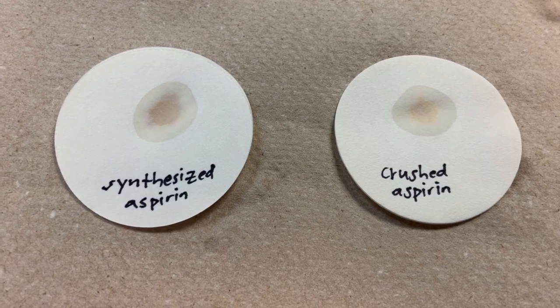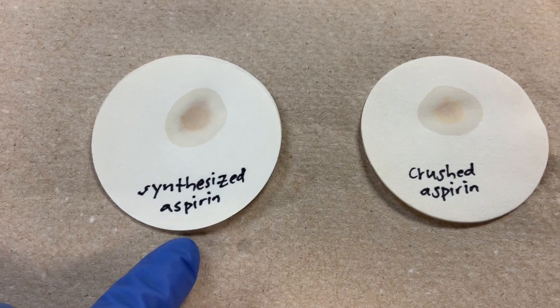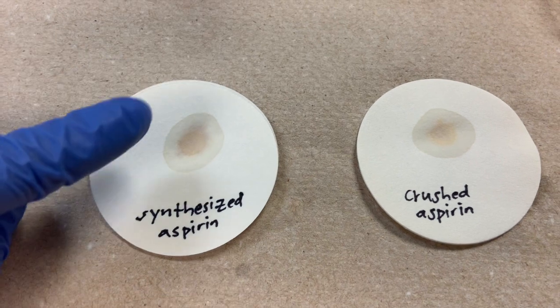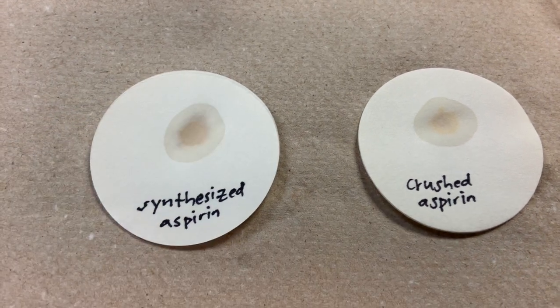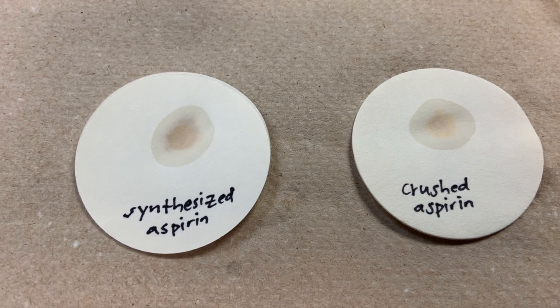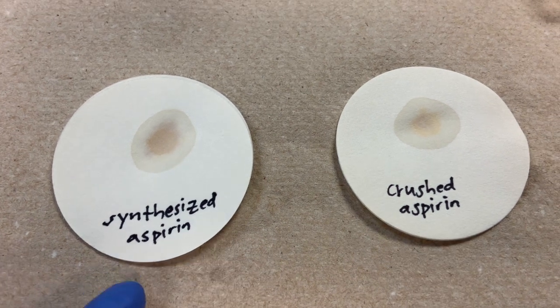So I just added a drop of my synthesized aspirin solution. So it's the synthesized aspirin mixed with acetone. And I applied it to the ferric chloride drop and I see that it's turning purple. So that tells me that there is still salicylic acid present in my synthesized aspirin.